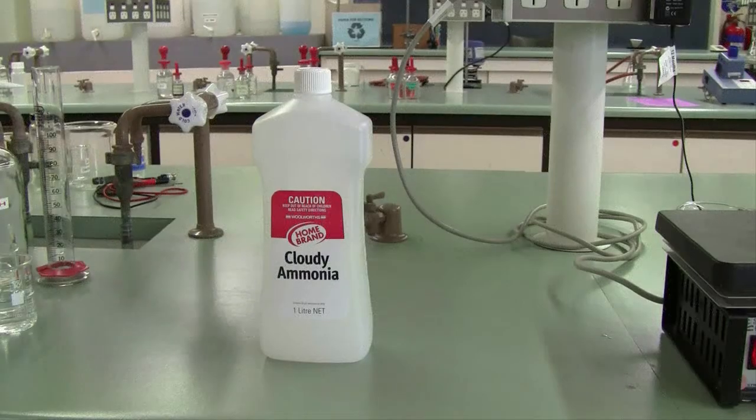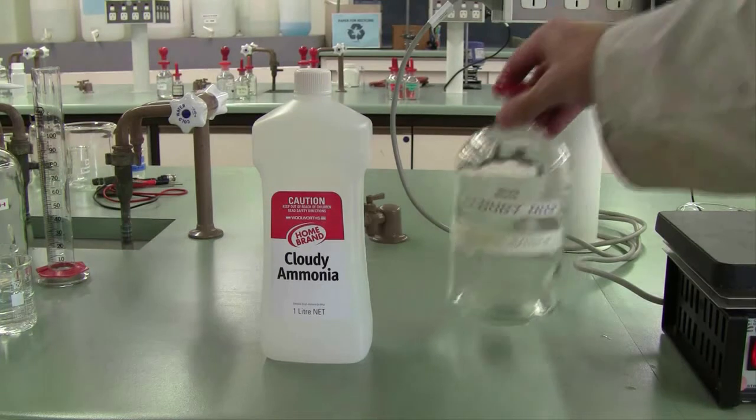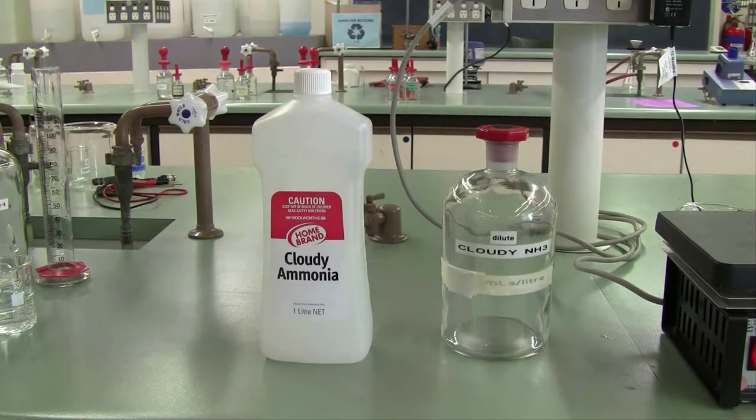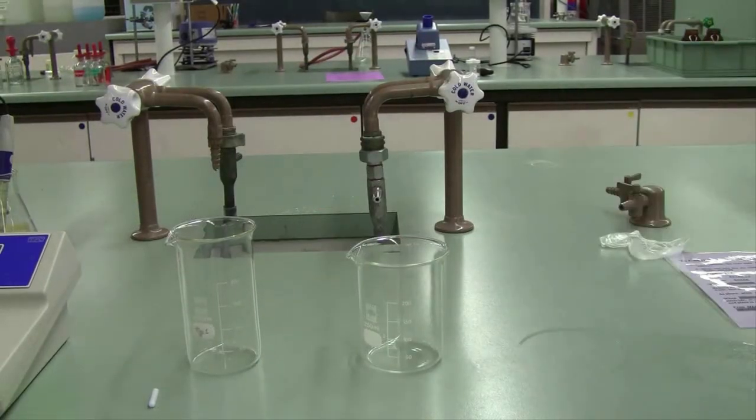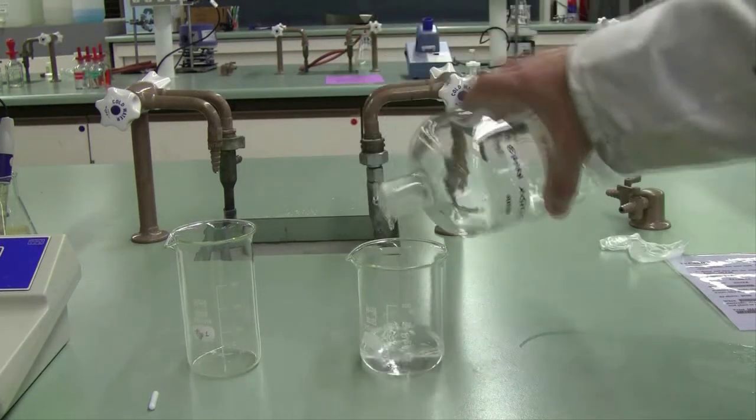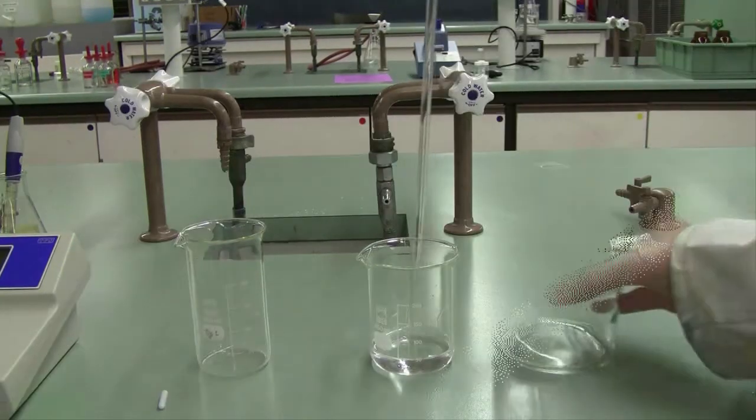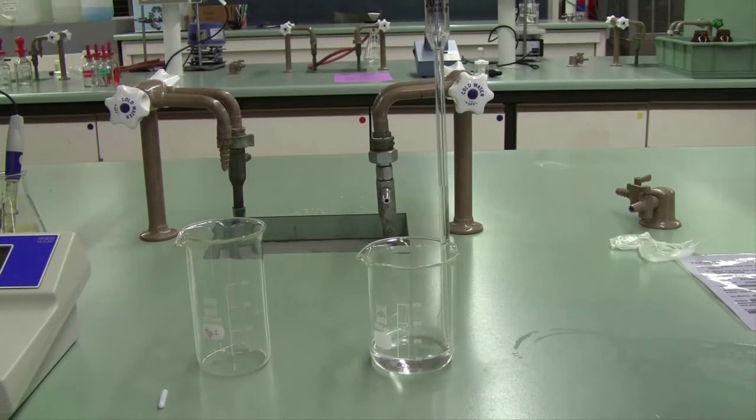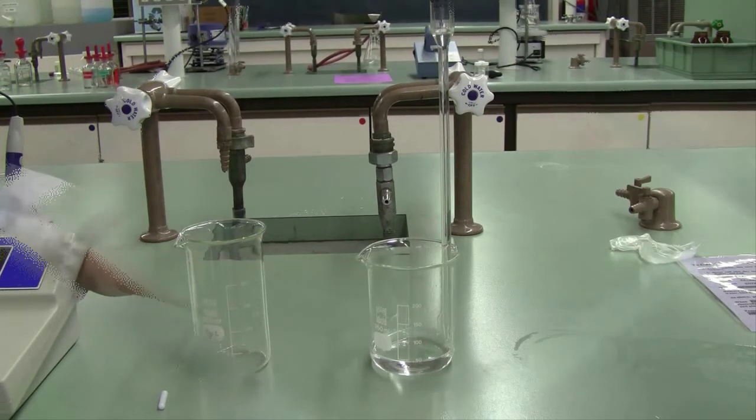The second half of your experiment involves the titration of a pre-diluted solution of a commercial product, cloudy ammonia. Take some of the pre-diluted ammonia solution, note the dilution factor. Take a 20 ml aliquot and deliver it into a tall narrow beaker.